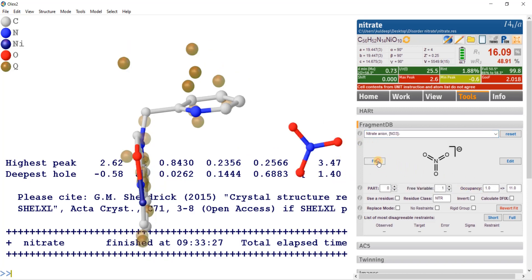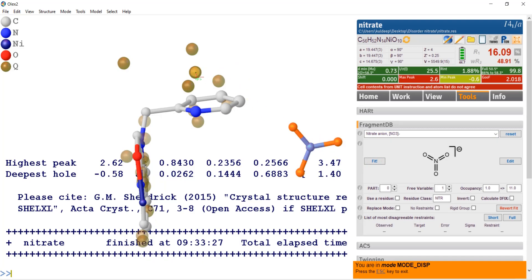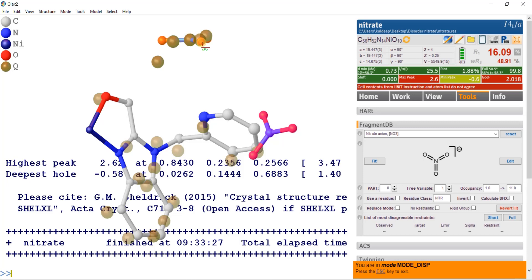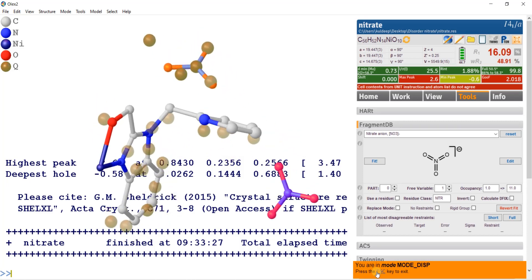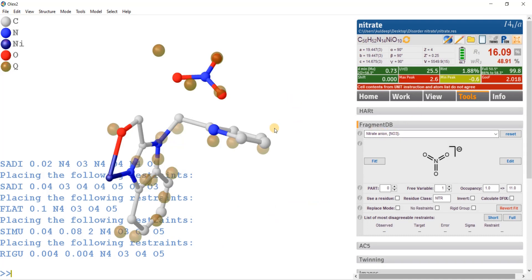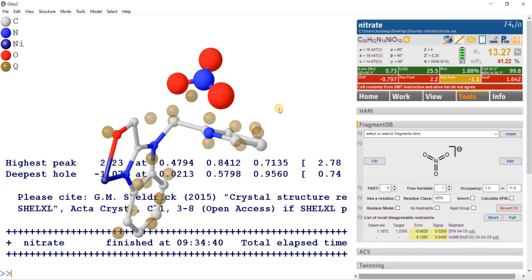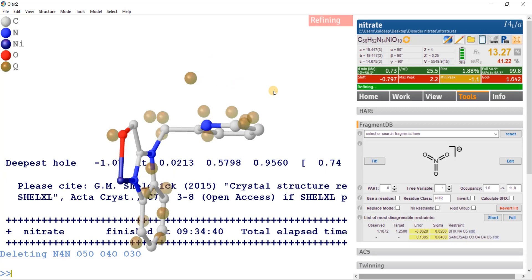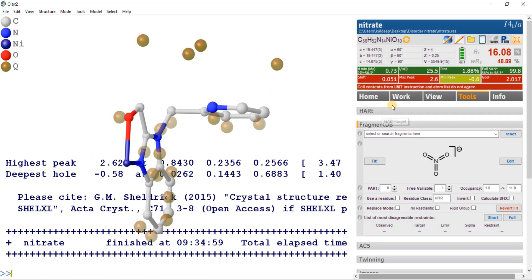I am going to fit: this nitrogen should be here, this oxygen should be here, this oxygen should be here. Now it is almost fitted — I can move it a little bit with the mouse. Now it seems okay. Press escape and refine with Control R. You can see the thermal ellipsoids are very big. Although the R factor decreases, the thermal ellipsoids are too big. So I am going to delete this nitrate and refine again, then compact.